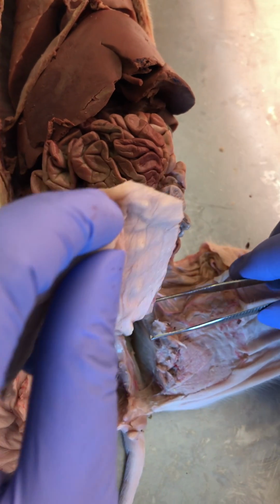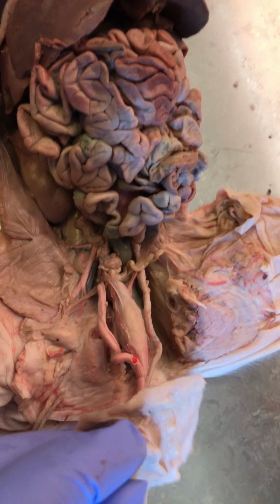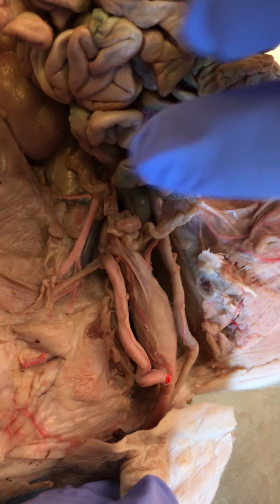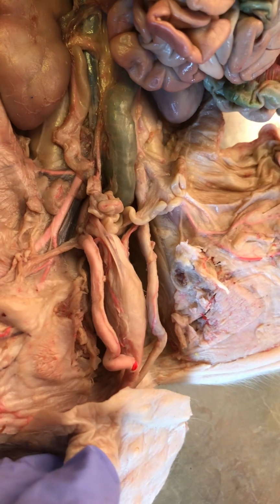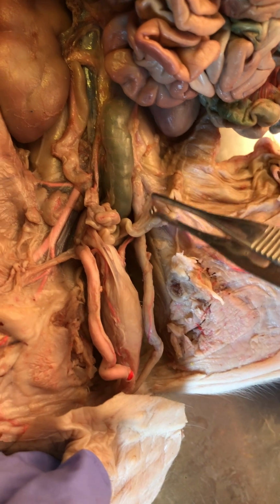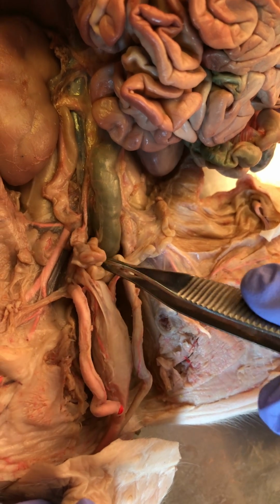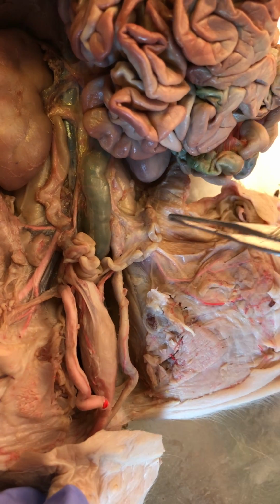But what we want to do is fold this back because there's a lot of stuff on top of each other. All right, so it'll allow us to really visualize the anatomy better. Okay. All right, and I want to move some of these viscera aside so we get a nice clear view. Okay, excellent. So these are her reproductive organs, the anterior most ones, and we have them on both sides, they're bilateral. I'm going to get this one out of the way a little bit. Okay, that's as good as it gets.